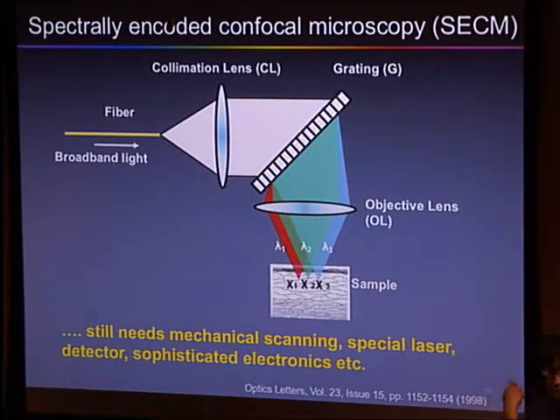So we talked about this grating trick, how we can spread light into multiple beams and then look at one line of the tissue without having a beam scanner. That's kind of cool, and that might help. But still the problem was that, especially with the endoscopy approach, the device needs to be mechanically moved to generate a two-dimensional image.